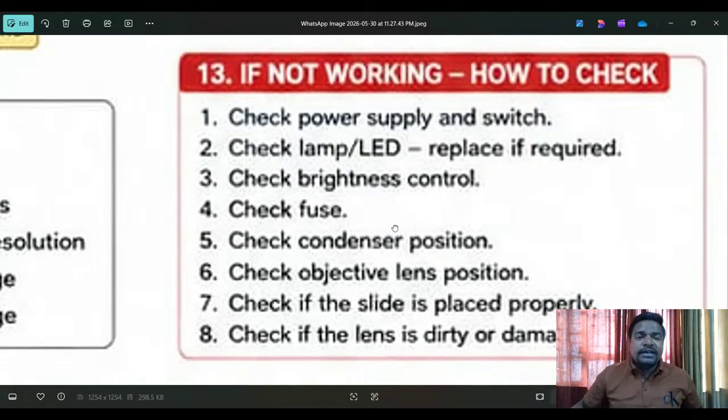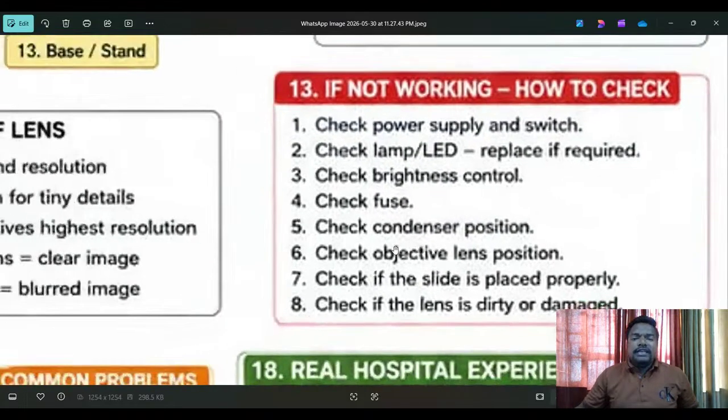Come here, 12th point. See here, you can observe it. I'm showing and explaining many things. That's why there are 24 points, and it takes 1 hour, so try to engage with this channel. Now see here, the main point I'm going to explain now is the 13th point.